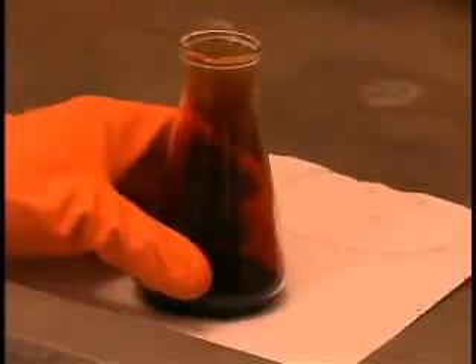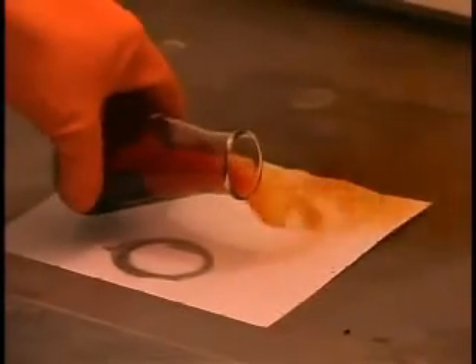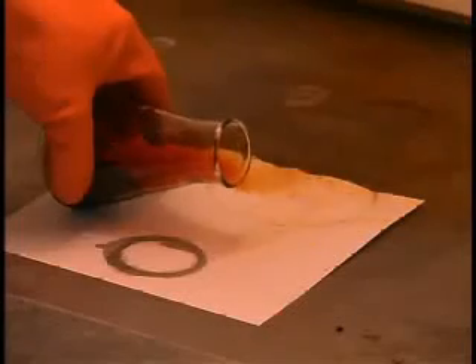We can also see that this gas is denser than air because we can actually pour that gas right out of the flask. It pours much like a liquid.